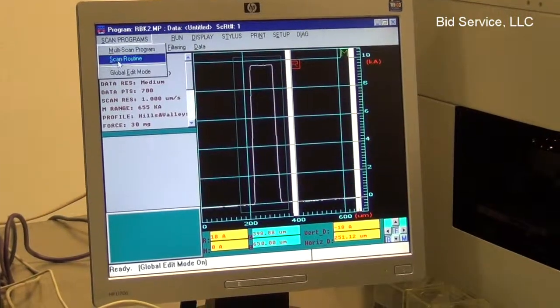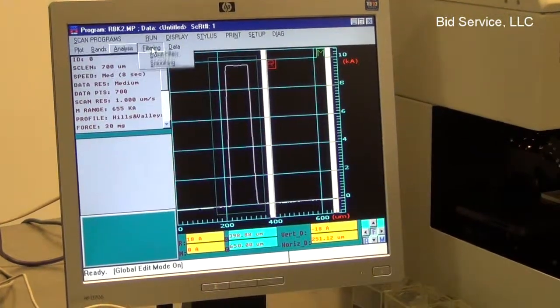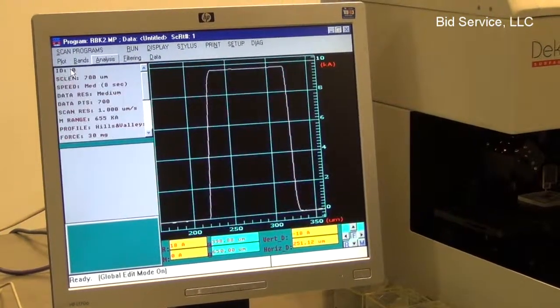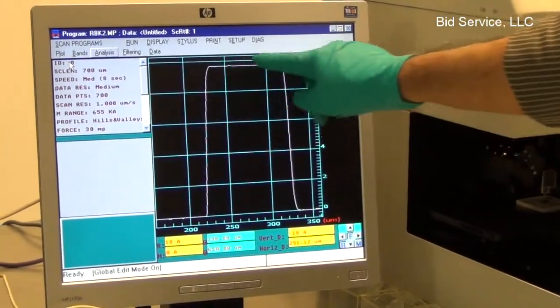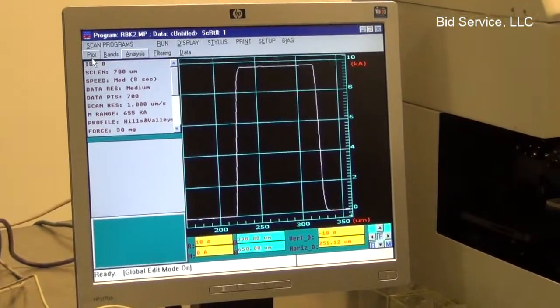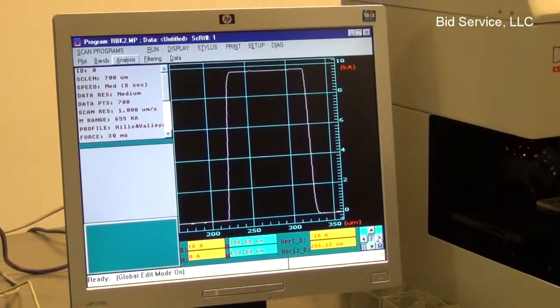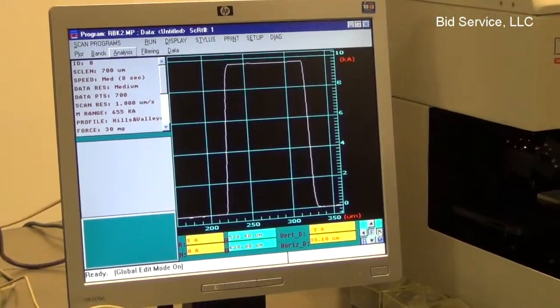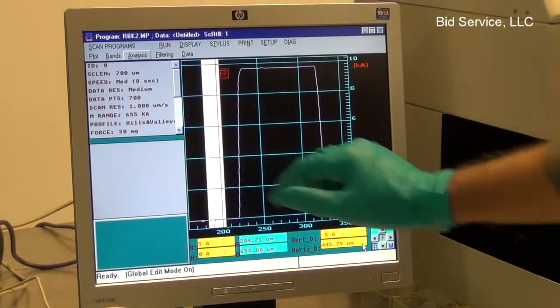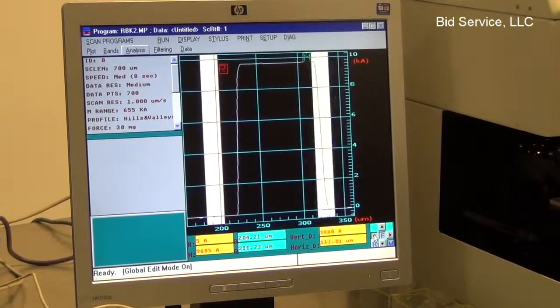and replot it. So this is the selected portion replotted if necessary. And now by selecting the reference cursor, I can bring it to the left of the step, and measurement cursor in the step area.